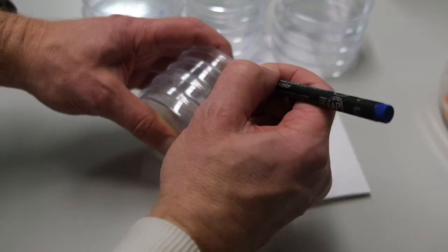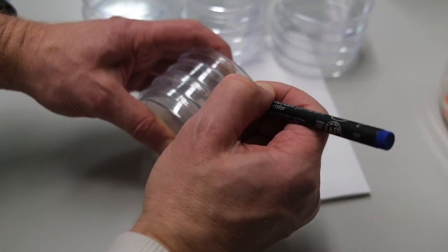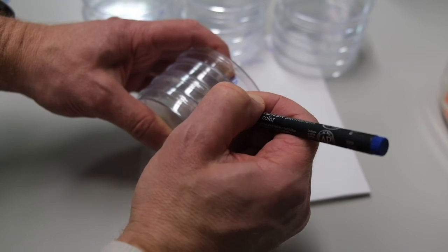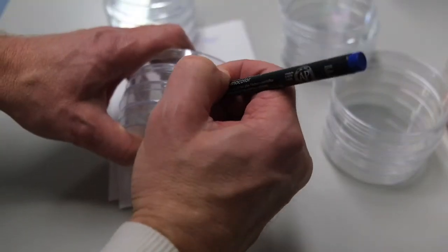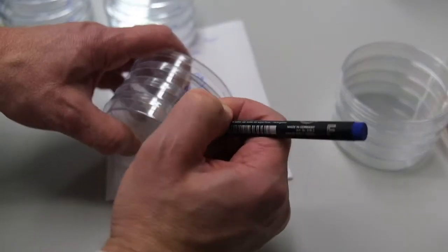And label them with the type of media we're going to use. NA for nutrient agar. Label all 16 on the bottom of the plates at the side.